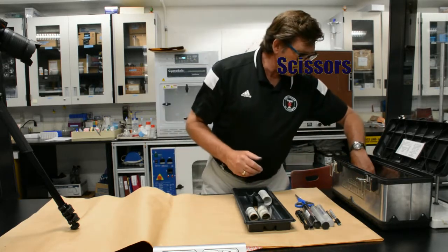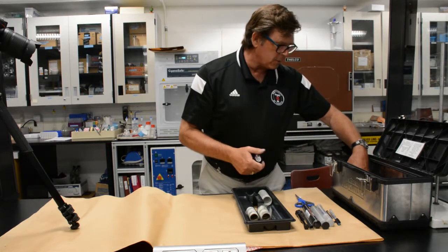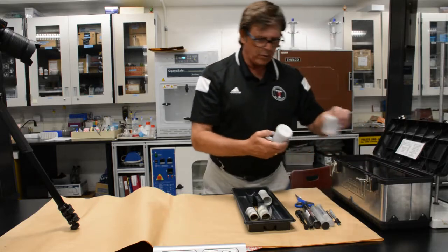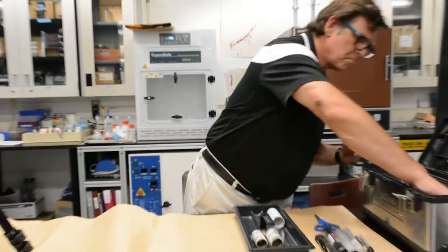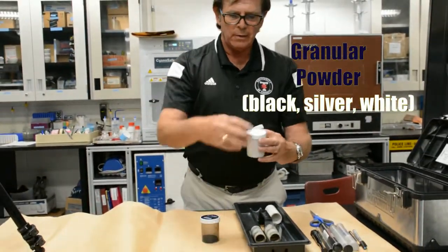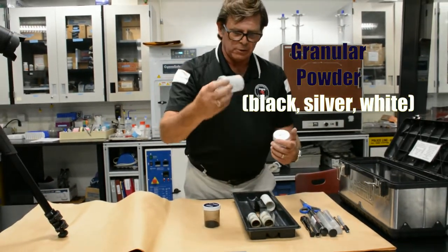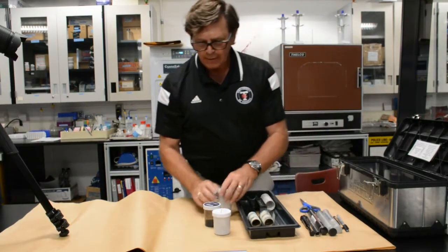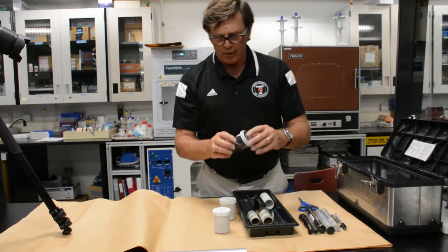So, as I said, we have the three fiberglass brushes in our kits, the black, the silver, and the white, and they work correspondingly with these powder jars. So we have black granular powder in this one. In this case, analytical gray, which is used with the silver or the gray brush, and the white granular powder in this. Now they are either going to be a talc base or a carbon base.